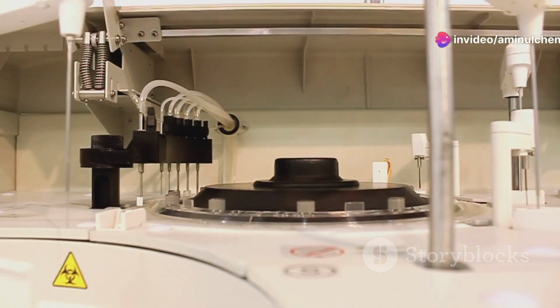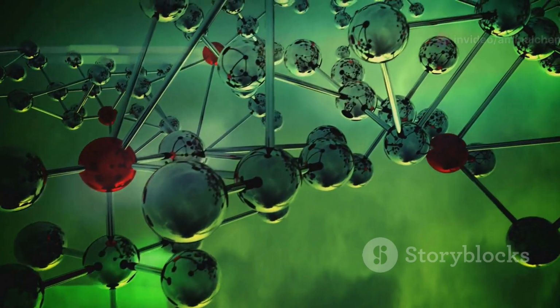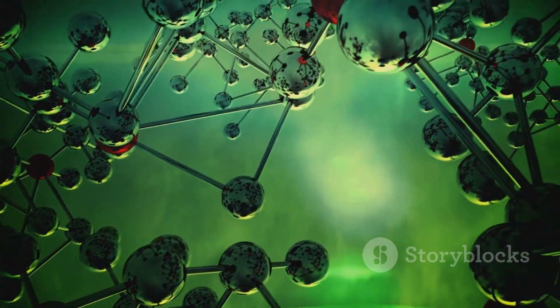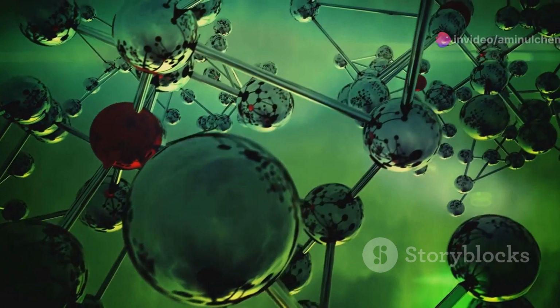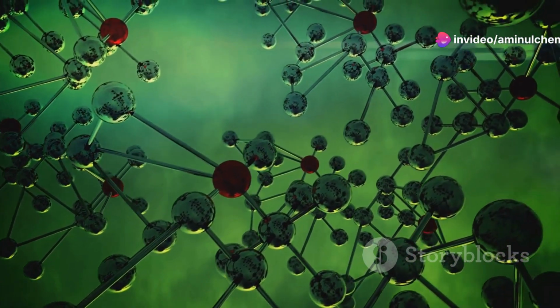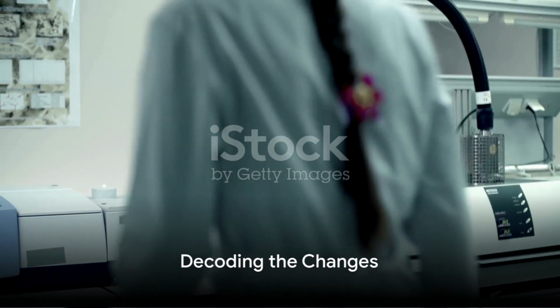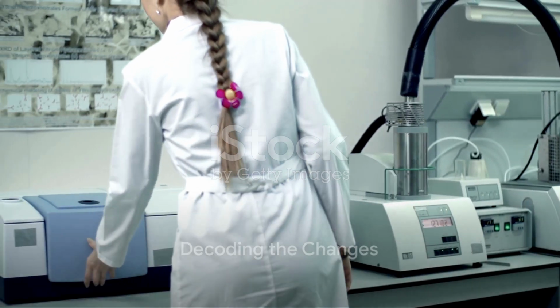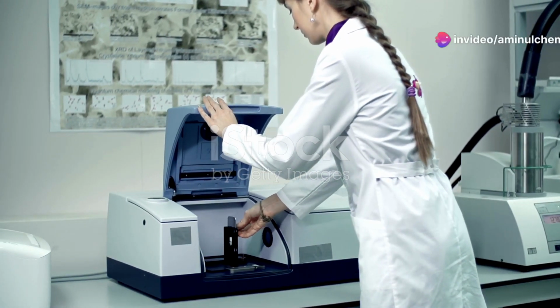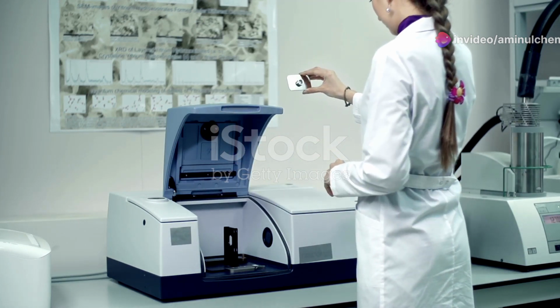It's fascinating to observe how these structures are arranged before they engage in the adsorption process. This initial analysis not only deepens our understanding but also prepares us to distinguish the subtle yet significant changes that will occur. This baseline is crucial, as it sets the reference point for any changes that occur during adsorption. After exposure to adsorbates, our once blank canvas now tells a complex story. Delving into the FTIR spectra post-adsorption, we observe notable transformations, each revealing critical interactions at the molecular level.